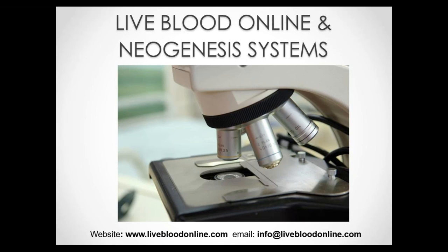Yeah, no, look, there are some practitioners who are skeptical of live blood analysis, and I mentioned this as one of the potential problems with the test, that there are many factors that will affect the outcome of a live blood test, which may then mean that a patient's results will vary dramatically from one day to the next, based on what they had to eat, when they ate, and how much water they drank, for example. Now, in practice, however, we simply don't see this type of variation. Of course, if a vegan, for example, decided to have a large steak a few hours before a live blood test, we can then expect to see the impact of this in the blood. But for patients following their normal daily routines, the results are always very accurate.